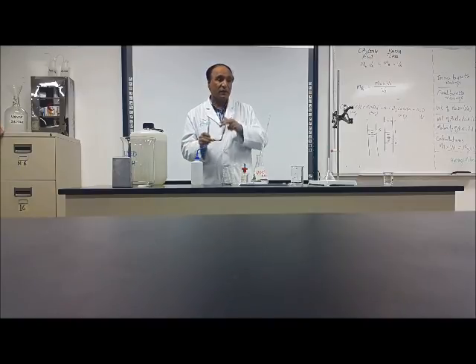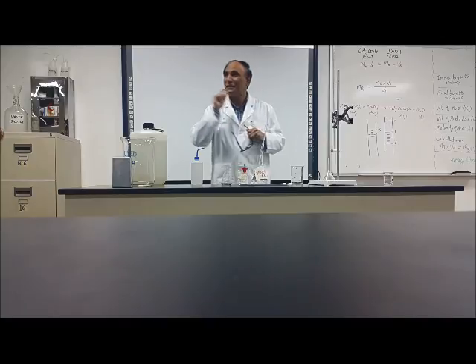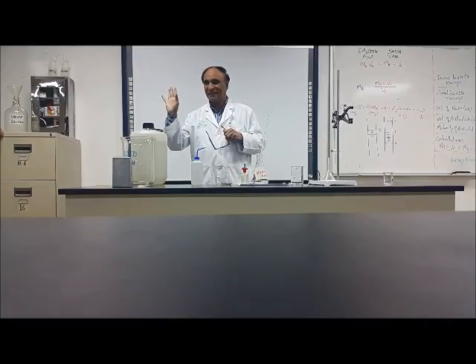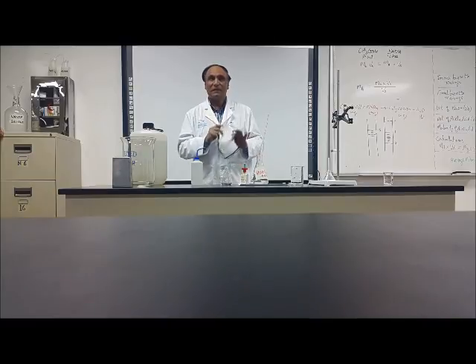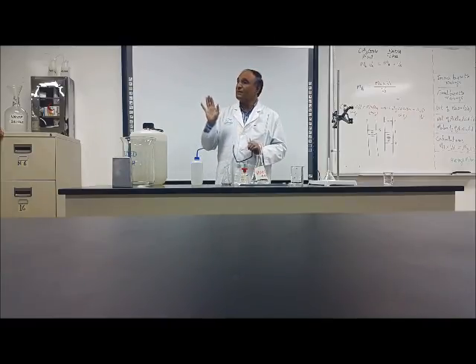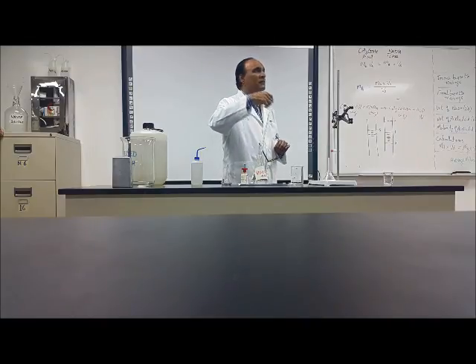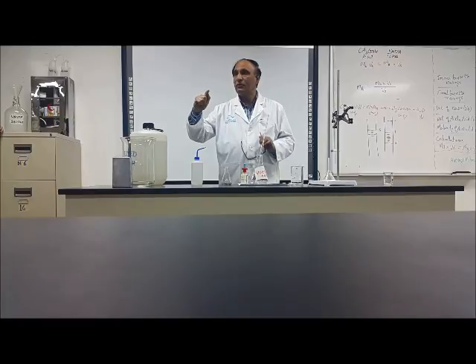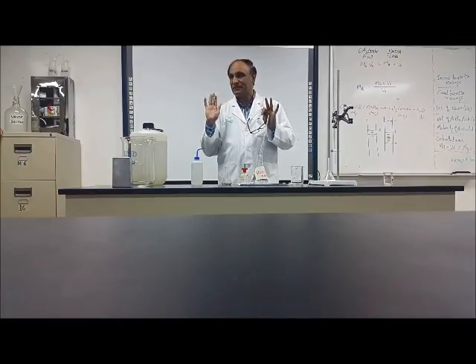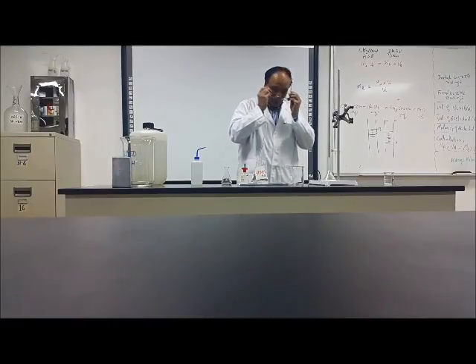So that's why we are doing it with the mouth. So if you drink a little bit, nothing to worry. Okay? Nothing to worry. This is khal. But if something is dangerous, then we will use the pipette filler. We will use it in some other experiment. You need to learn both of the ways. So this is the easy way, that's why I'm using this, right?